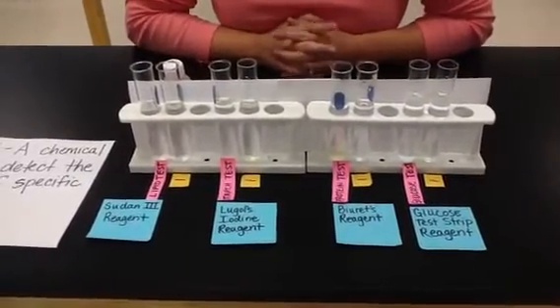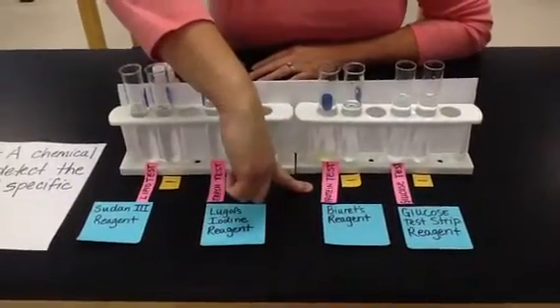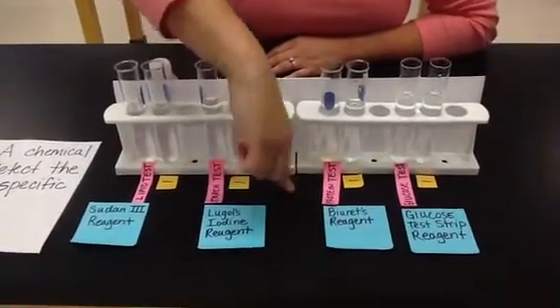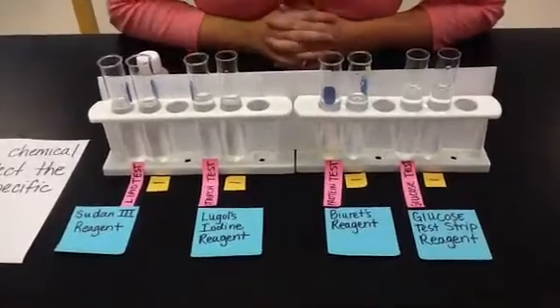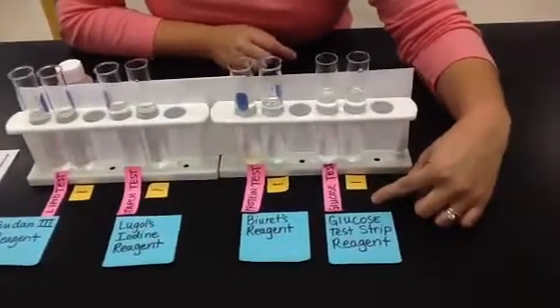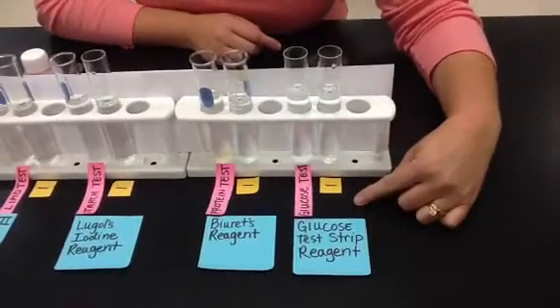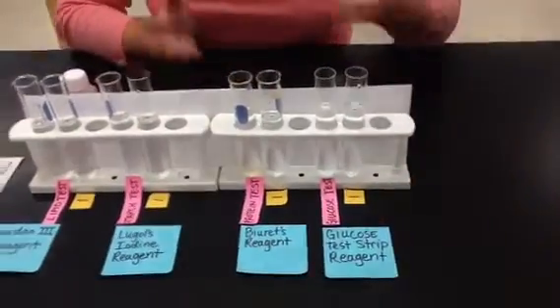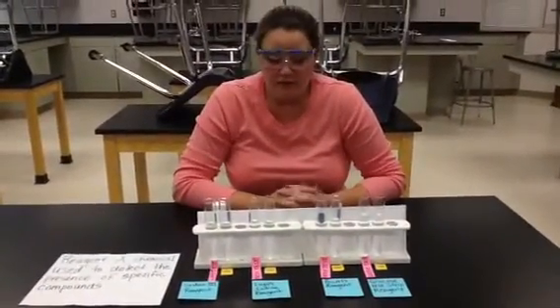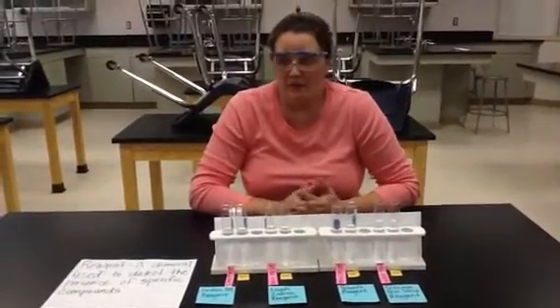Sorry for that interruption. We are in a school, I guess. So this is our protein test. Remember, this is another organic compound, and it is made up of amino acids, and amino acids are the monomers that make up our proteins. And then we have over here a glucose test, and remember that's a monosaccharide. It's very important in plants and animals and is also part of the carbohydrate family. You'll notice that we're not testing for DNA or nucleic acids at this point, just because it's a harder test for us to do. So we're going to focus on these molecules at this time.